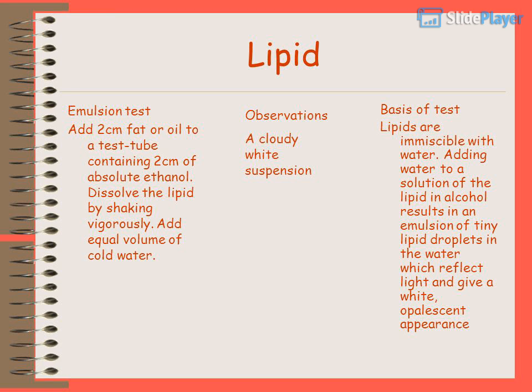Adding water to a solution of the lipid and alcohol results in an emulsion of tiny lipid droplets in the water, which reflect light and give a white, opalescent appearance. Observations: a cloudy white suspension.